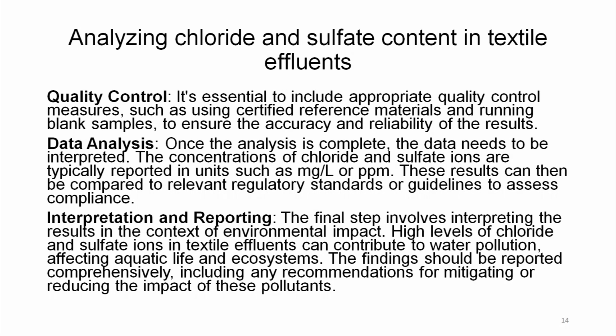Data analysis. Once the analysis is complete, the data needs to be interpreted. The concentration of chloride and sulphate ions are typically reported in units such as milligram per liter or ppm. These results can then be compared to relevant regulatory standards or guidelines to assess compliance.